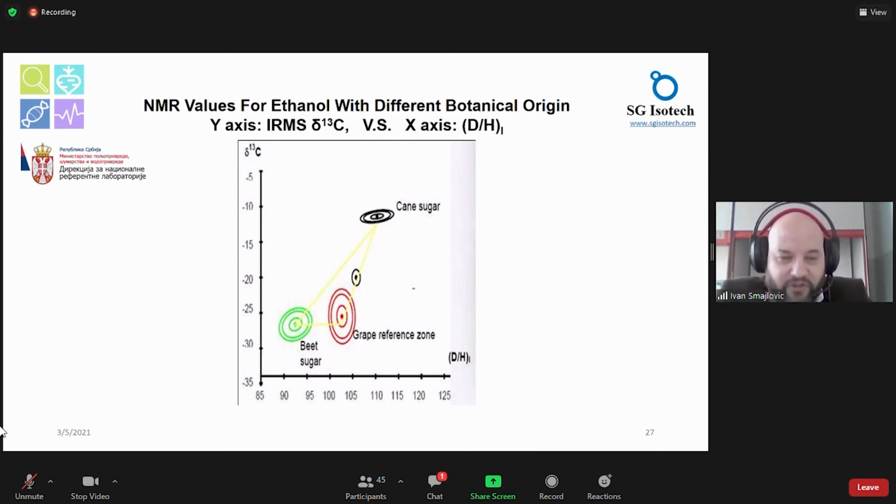First of all, they don't have the original information from the data bank, because these are top secret national databases. They are not given to third parties, and it is very difficult. This is the submolecular level. You cannot do these things very easily as a technologist. You can make the 12% volume of alcoholic strength in your wine, but you cannot make this isotopic profile look the same as the original, and they can check this.